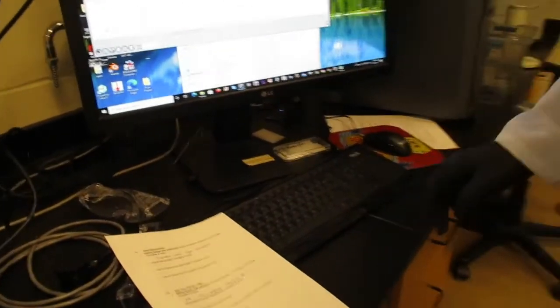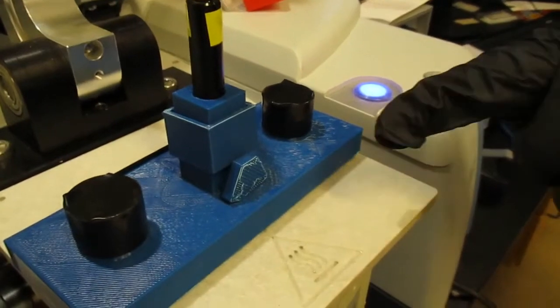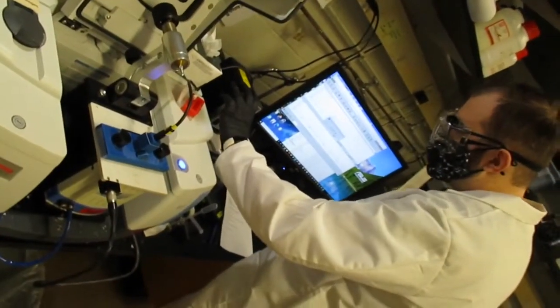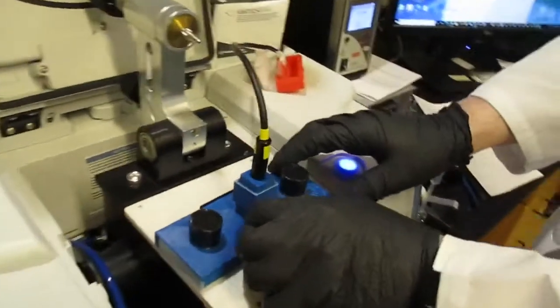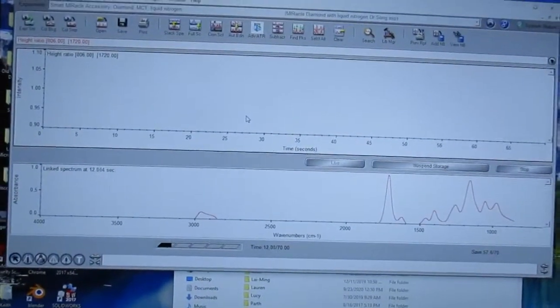So to start it, the easiest way is to hit the space bar on the keyboard. So what we're going to do in order is we're going to turn on the light source, we're going to hit the space bar, and then we're going to pull out the light blocker. So I'm going to do just that. I turn on the light source by hitting start. I press the space bar to start the experiment. I usually wait about 5 seconds. And then you pull out the light blocker. And now it's taking data in real time.